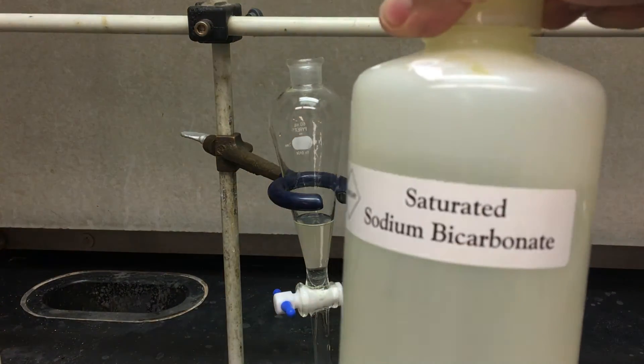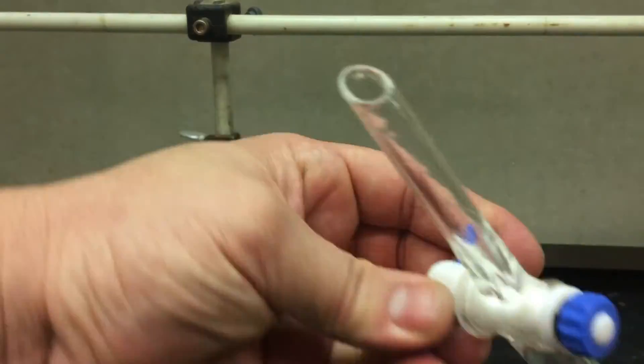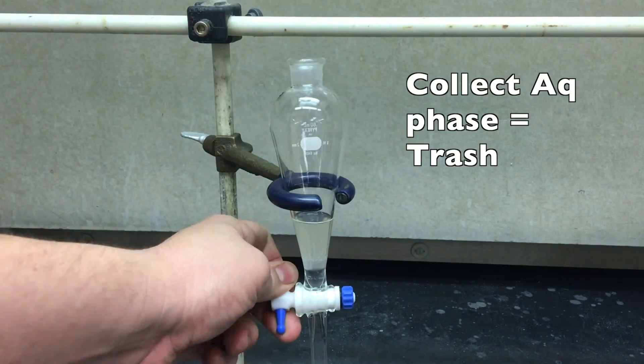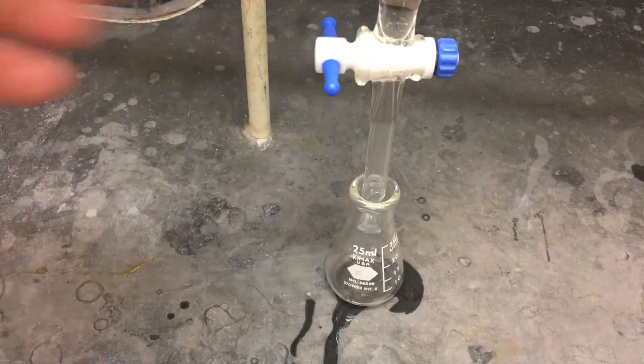Neutralize whatever acid is remaining in the solution with saturated sodium bicarbonate. And for the billionth time, cap it, shake it, exhaust it, let it settle. Collect the lower aqueous phase — I'm using the same container; it's all junk anyway, it doesn't matter. And now in a separate container, we're going to collect our organic phase.